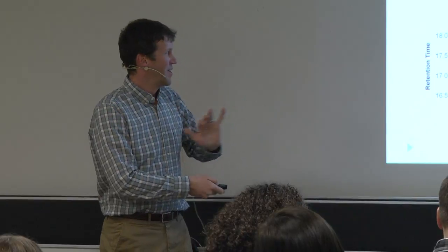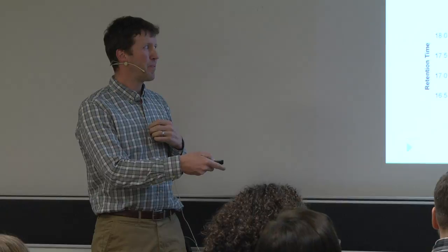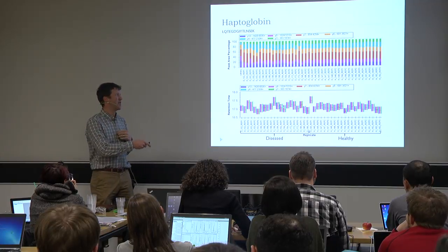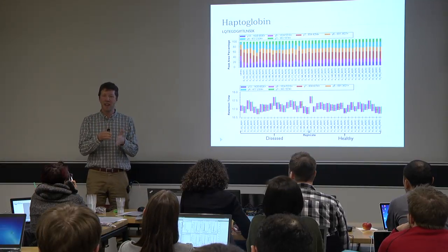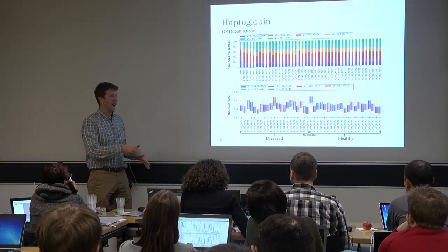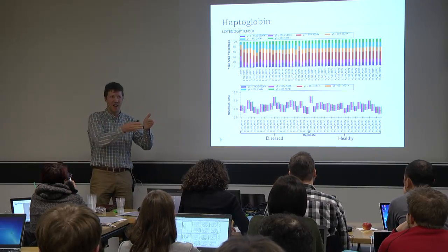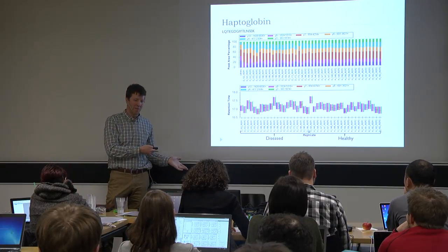So this is not actually the true order that they were measured in, which is one reason this one might be popping out, because it might actually be measured right next to this one or something like that. But it turns out that when we look at this data, this one always sort of pops out a little bit. I don't know what happened, something happened in the chromatography. It's always a little bit out there, and that's a consistent thing. If we had IRTs, we could normalize to the IRTs, and these would get very, very straight across. But this is pretty good chromatography. There's not a big problem here.